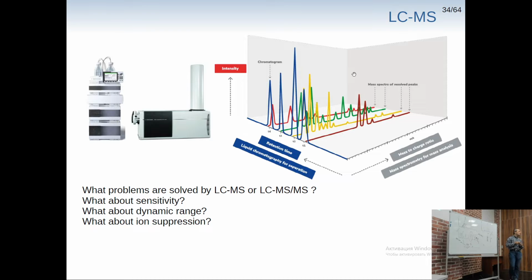Will we get the same set of data? No, absolutely not, because it's only rules. For instance, you've injected just some nanoliter more of your solution. Your times will move here just 1.8 seconds, for instance, which is negligible.